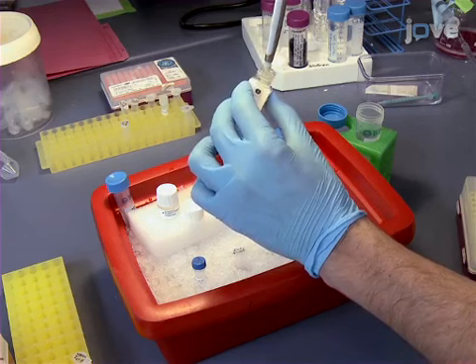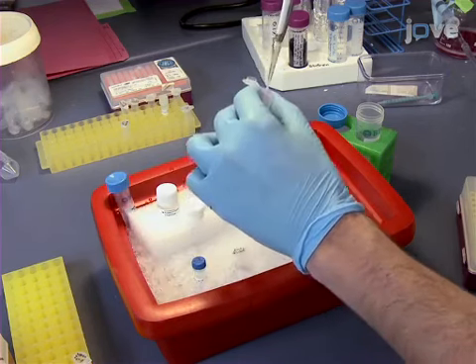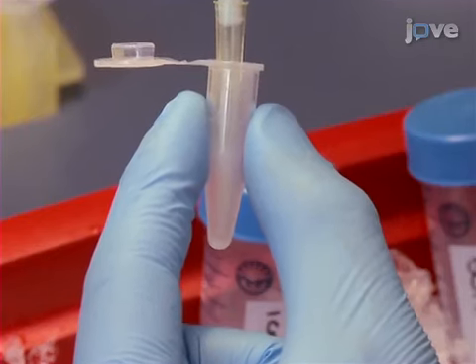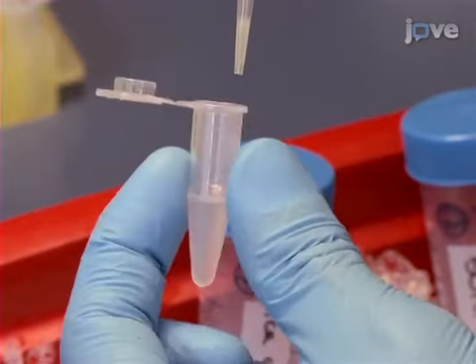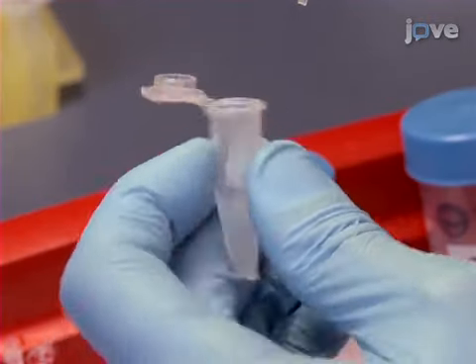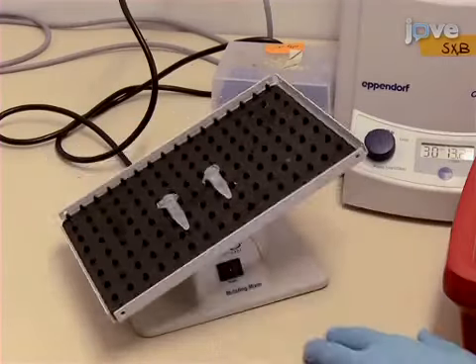Before precipitating and immobilizing a target protein, prepare a 50% slurry of protein A or protein G coated agarose beads as described in the written protocol. As a final step, add an equal volume of 50% slurry to each antibody lysate sample and nutate for at least 1 hour at 4 degrees Celsius.